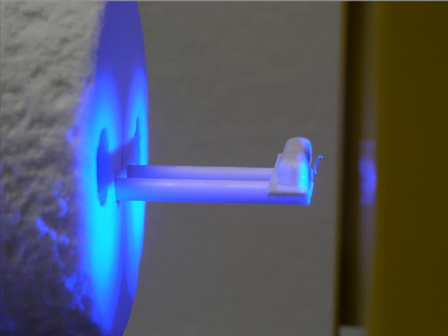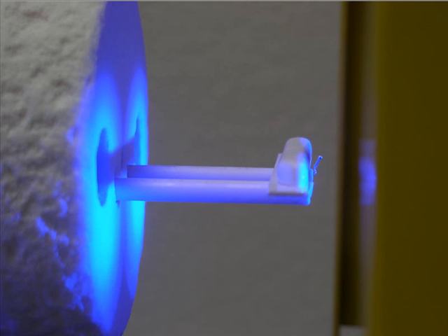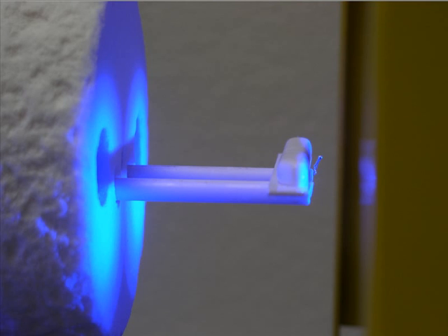The sample is 50 mm long and it can be pressed from powder or cut from the material to be analyzed. The sample is held in place by two refractory rods and it can be supported by an alumina plate. The sample is placed horizontally on the alumina plate or directly on the two rods. If during the sintering process there is a development of liquid glassy phases which may wet the surface, the sample sticks on the plate and the sintering process is disturbed.